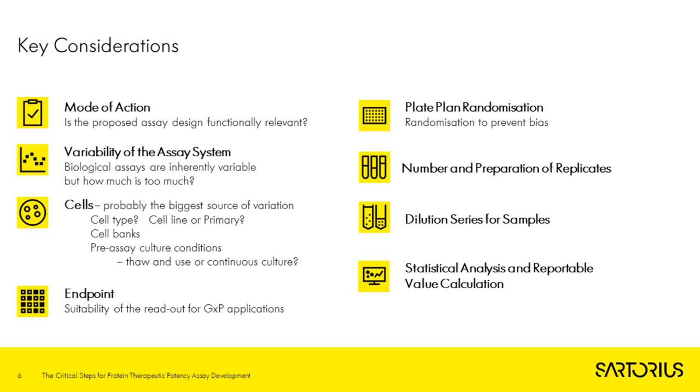So in terms of the dilution series, as a general starting point, it's a good idea to have a fairly wide and consistent dilution series, with the goal to capture the upper and lower asymptote and our linear response. And once the other development conditions are set, we can then look at adjusting the dilution series to provide the best coverage.